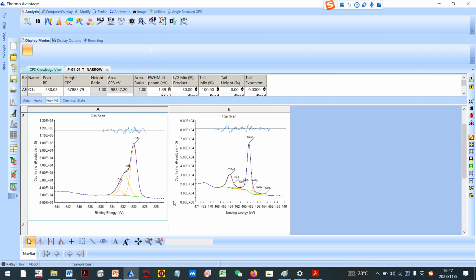Hello, dear friend. Today, let's discuss the binding energy of different chemical states for the oxygen peak.